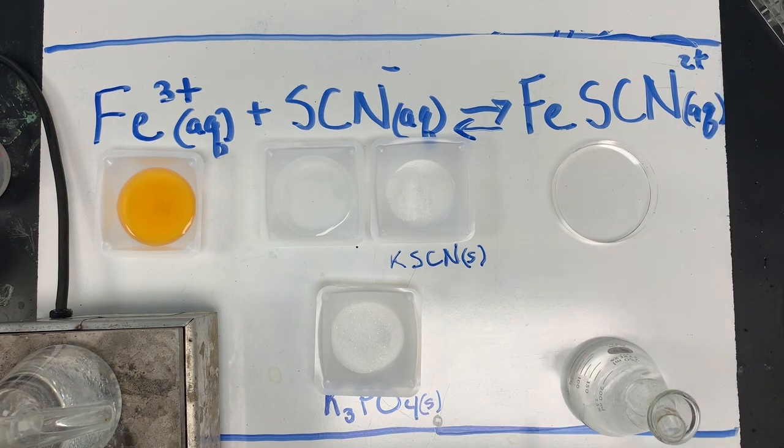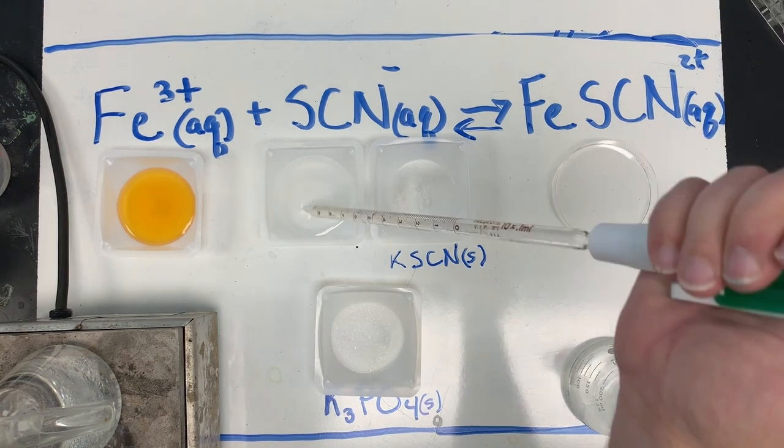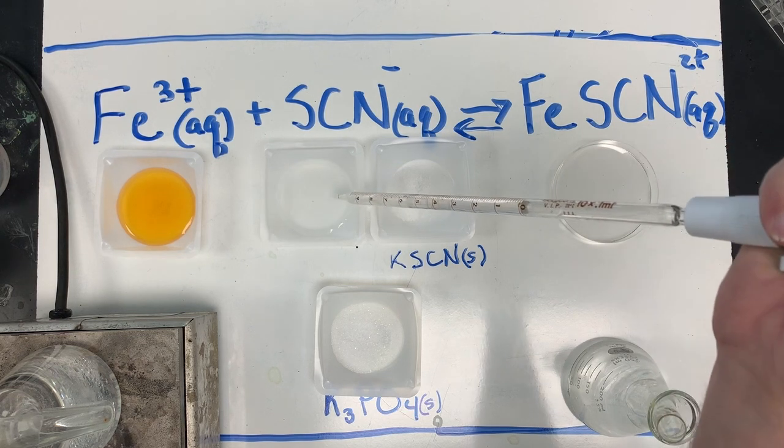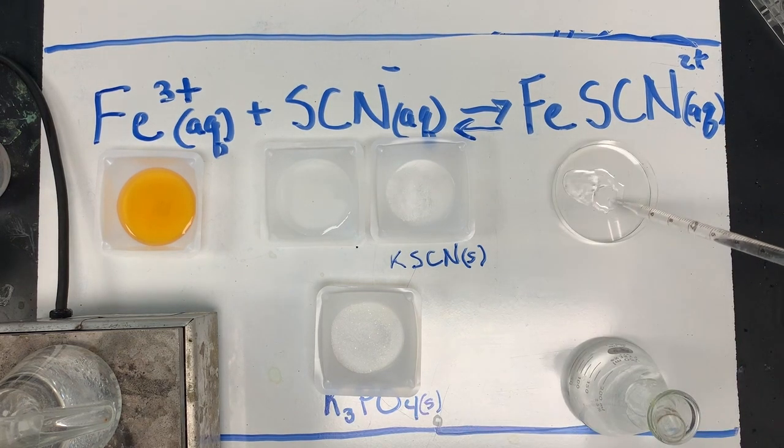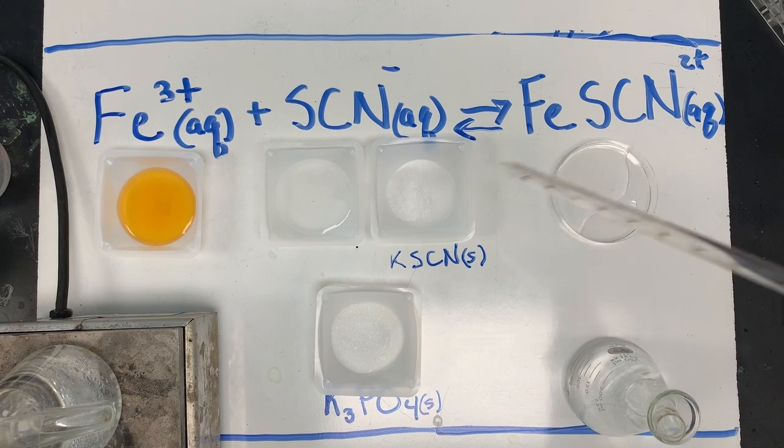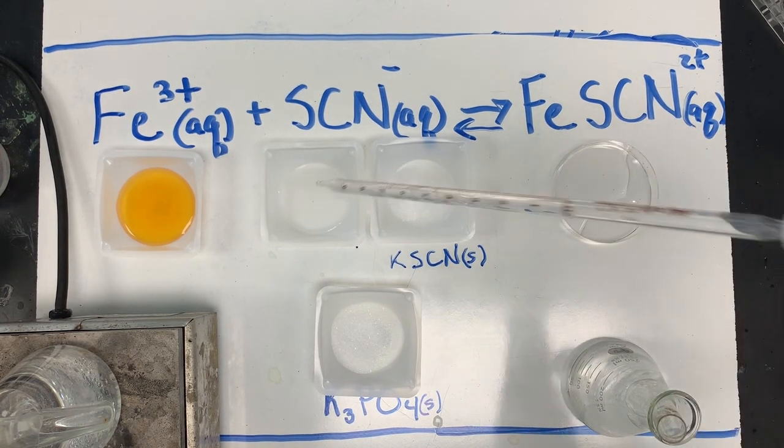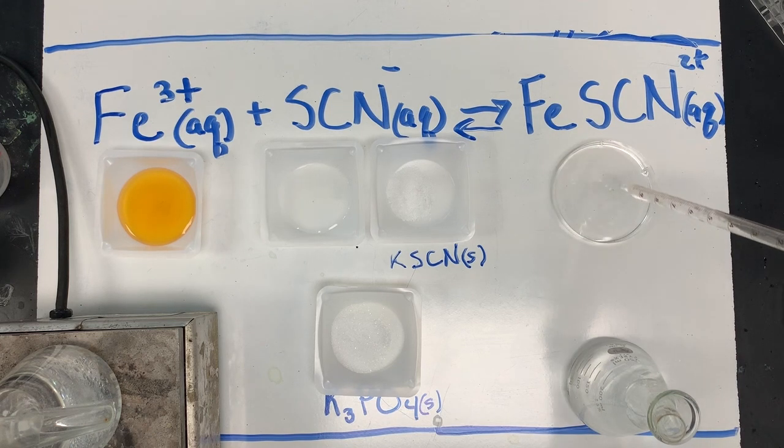So the first thing I need to do is put about 20 milliliters of thiocyanate into my dish. So I'm going to measure that out and put it in the dish. I'll get this was 10 milliliters. Here is another 10 milliliters. And we'll place that in the dish. Now we have our thiocyanate in solution.